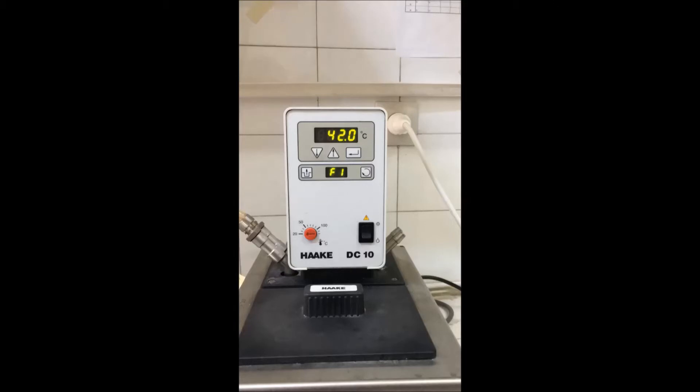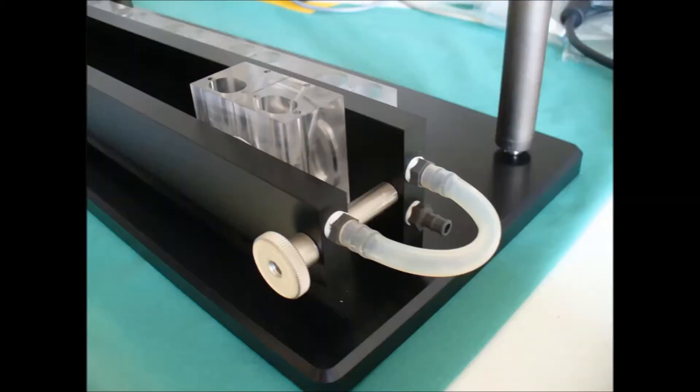We adjust the thermoregulator at the water bath to about 42 degrees Celsius because it will lose warmth within the heat conduction tubes.